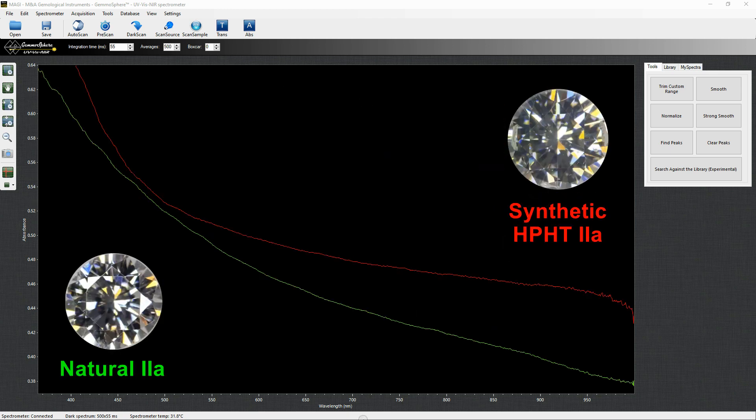Unfortunately, colorless HPHT synthetics show no significant features in the UV-Visnir range, and their spectra are quite similar to the natural 2A.